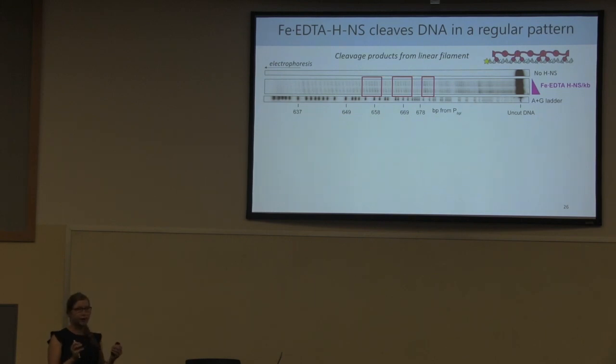Those bands were much brighter. But I couldn't really tell from looking at this gel what was going on. And so I quantified this to investigate how much each base is being cut on the DNA.